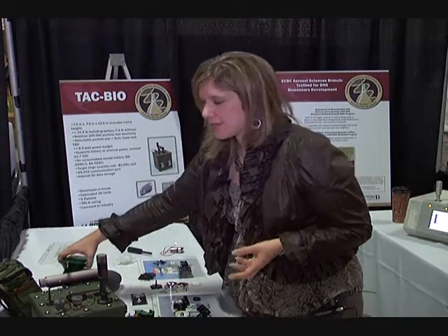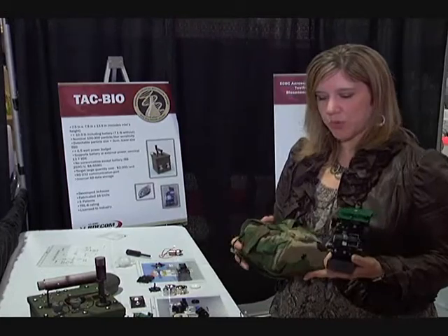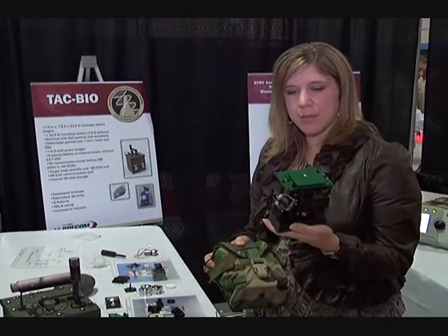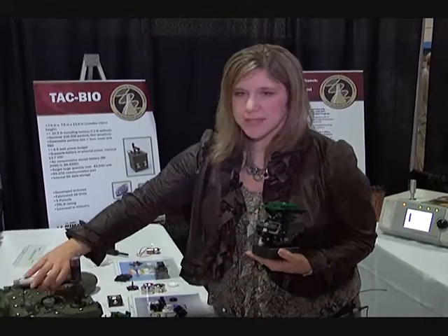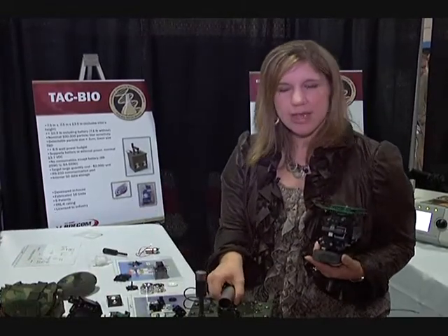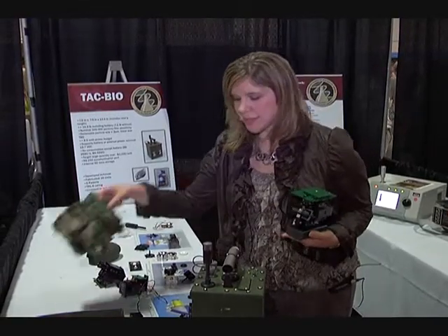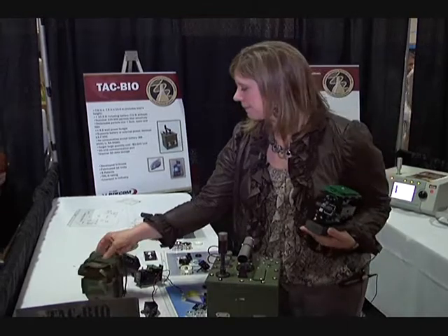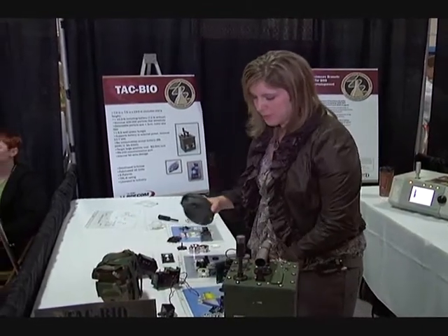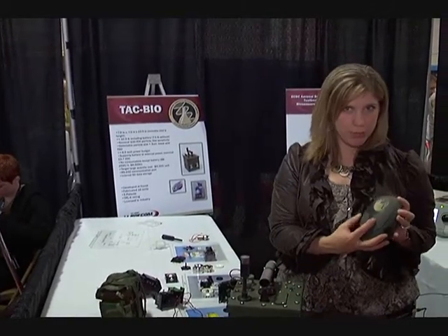We also, because it's so small, are able to put it in different packages. For example, this is an SLA mockup of all the current parts that would fit. So this detector that we showed you before is one that we made for the Marines that is slightly more rugged. But we could also fit it into something as small as this bag, or we could even position it into something as small as something that would now look a little bit more wearable.